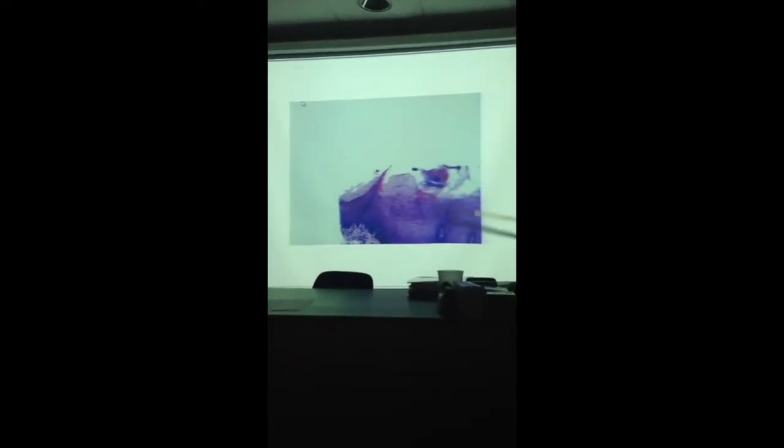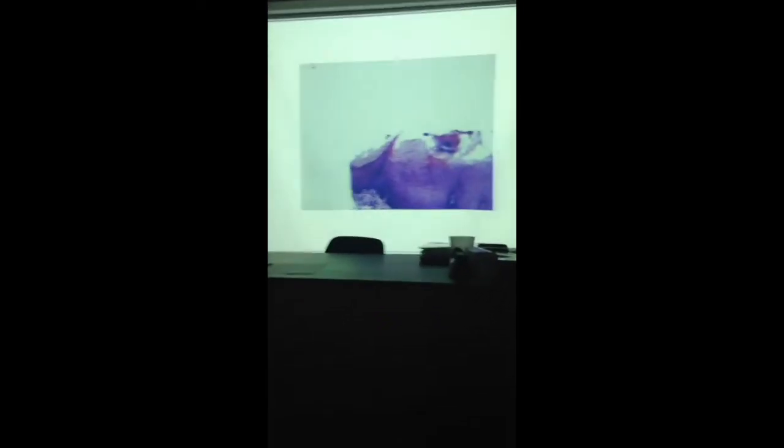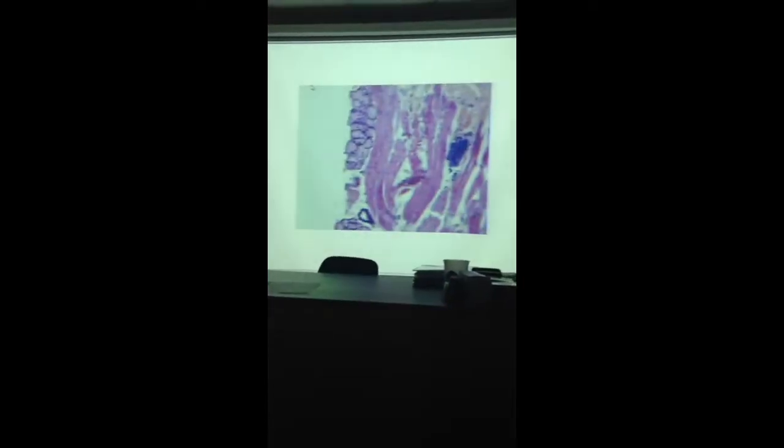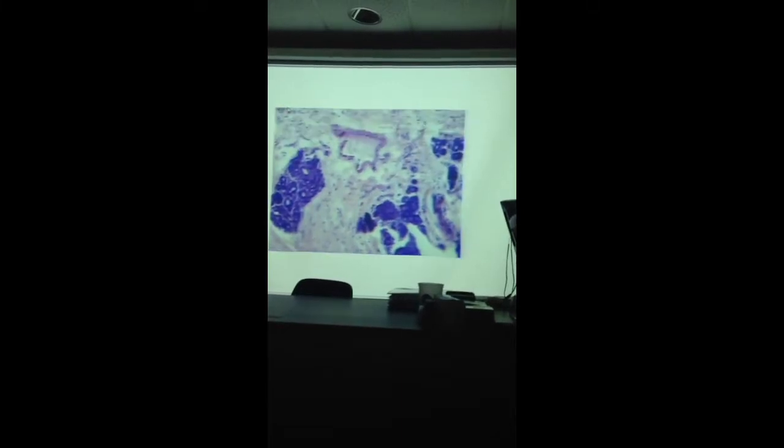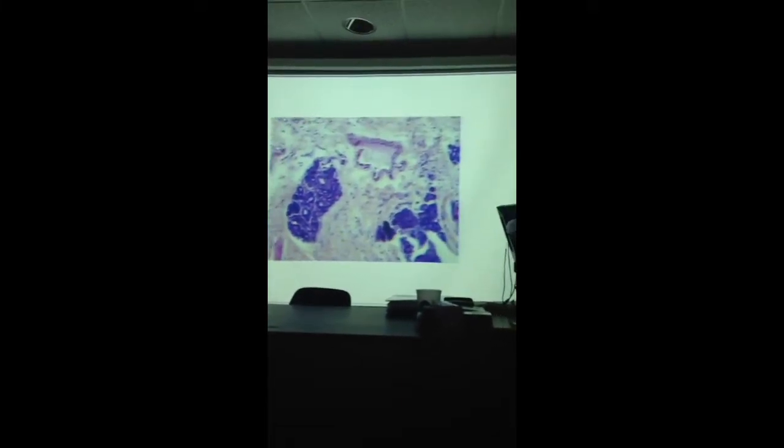So these are the filiform, the smallest and the most numerous, compared to the circumvallate. But again, no taste buds are associated with them. Also in the tongue slide, you can see some other important structures. You see these dark purple cells here, what are they?